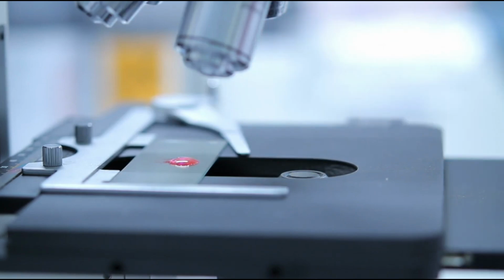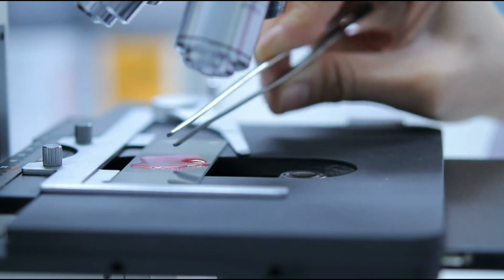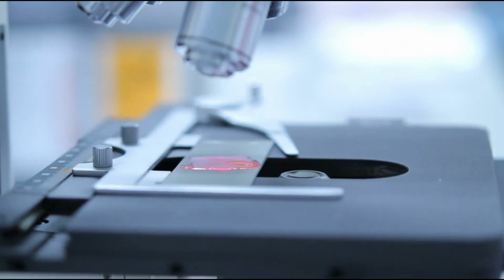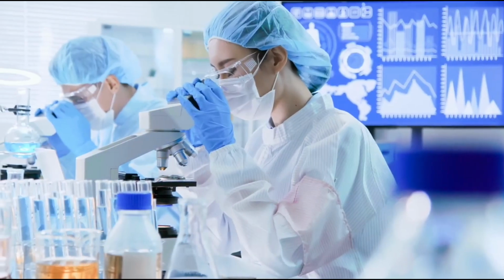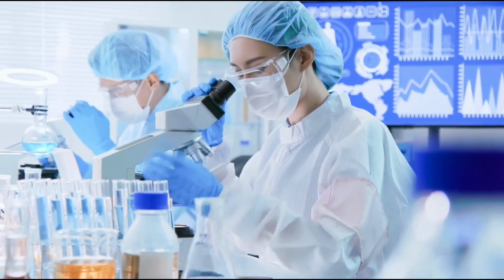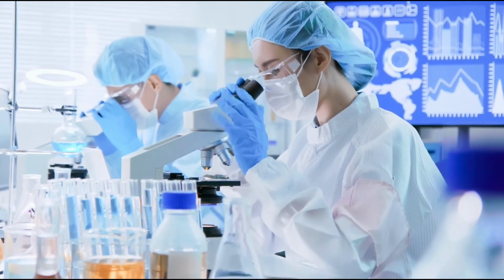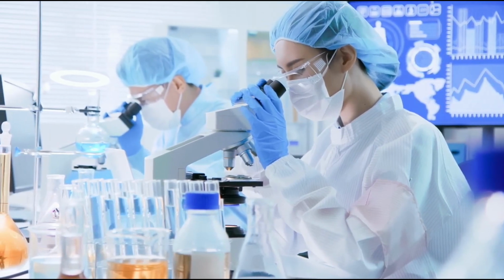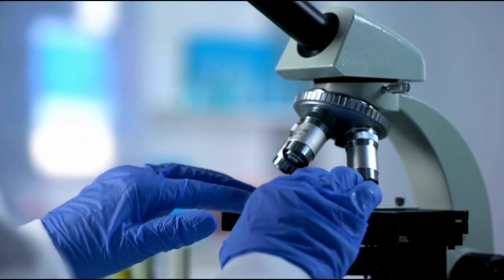There are various types of microscopes, each tailored for specific applications. Light microscopes, for instance, use visible light to illuminate specimens, making them ideal for observing live cells and organisms. In contrast, electron microscopes utilize beams of electrons, achieving astonishing magnifications that can reveal the structure of atoms. This capability allows scientists to investigate the fine details of materials, from the surface textures of metals to the intricate architectures of biological cells.